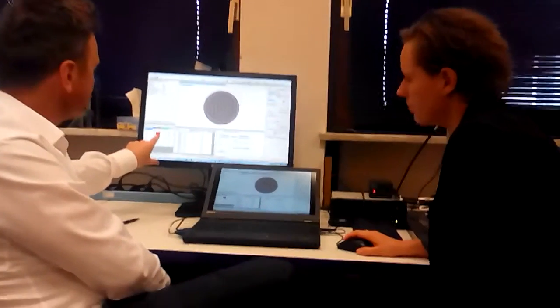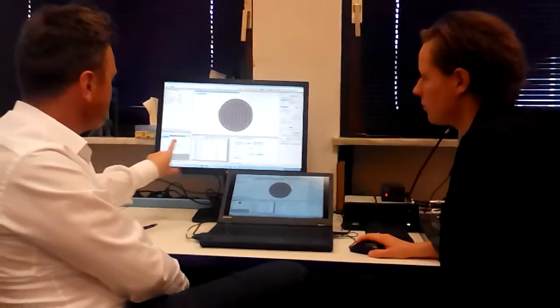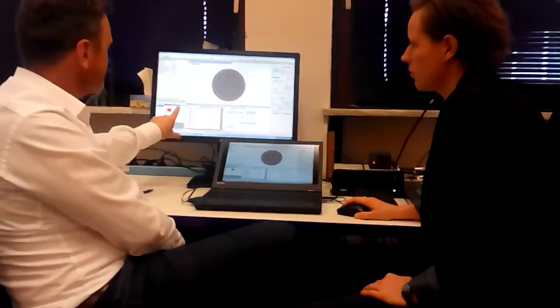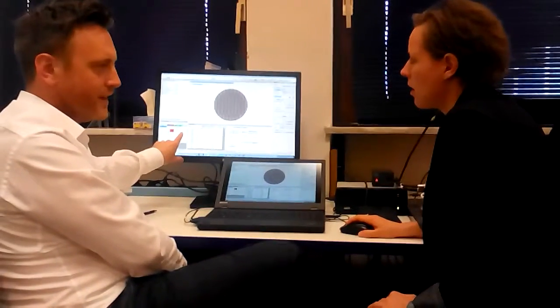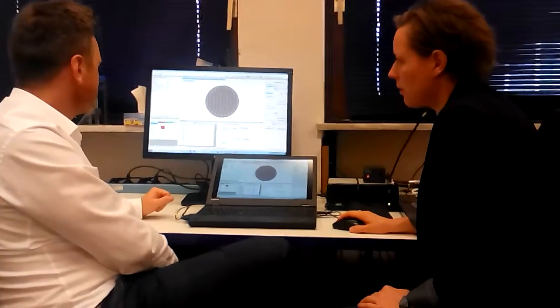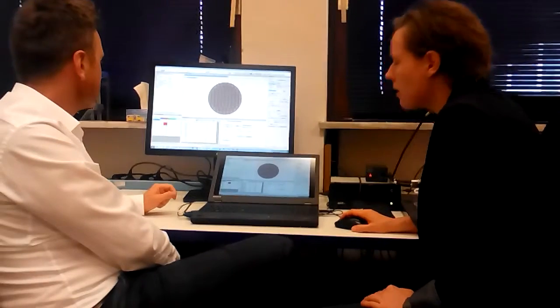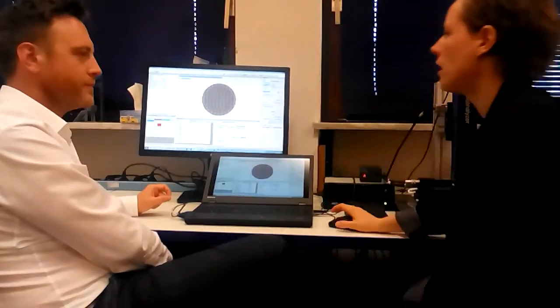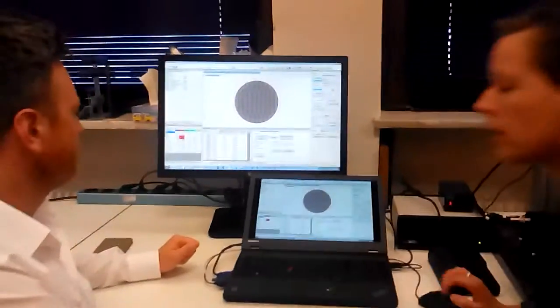We are allowed to have 250 particles of this size in this area. But the reason it's red is because it has counted 259 metallic particles, so it's a failure. It's the sum in total, not only the metals or fibers or whatever. It is allowed only to have 250, and we have more than 900.